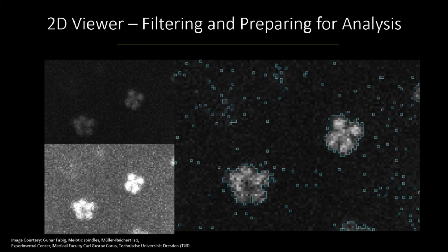So one is, we'll start very simple. We have, of course, the image with these two little blobs for now. What do you call them? Blobs. And we can scale this image in a couple of ways. If we scale it so that these appear quite bright, we can see that there's quite a bit of bright pixels. But we know, at least I know, and I think probably a majority or all of you know, that there's nothing here. There's probably nothing here. This is real and this is not.